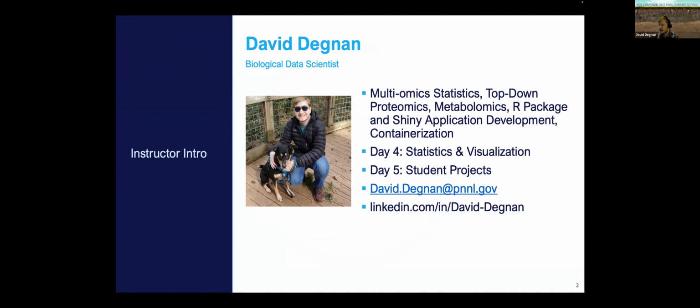I am here with you today to talk about differential abundance, and if you are interested in coding, we have a vignette this afternoon that you can go through for doing this kind of analysis. There is no GUI implementation, it's new. So we will do that later today, and I'll be happy to help you along with my colleagues who are presenting this afternoon. I'll also be with you on day 5 for the student projects as your stats and data scientist experts.